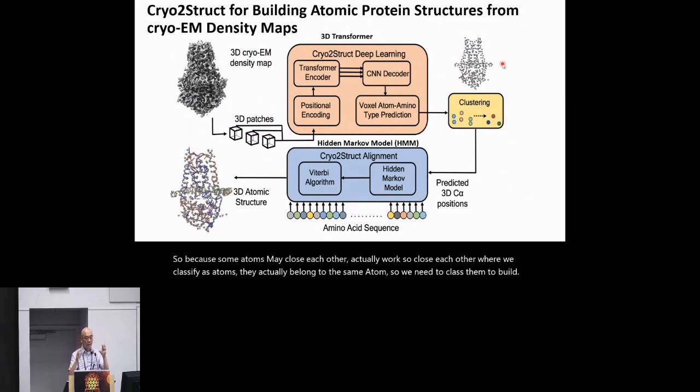identify all the atoms. Now these atoms can be used to build a hidden Markov model, a latent hidden Markov model, because they have the probability, or emission probability, of the amino acid type. Then I can align each chain sequence against this hidden Markov model. So I build the final 3D structure of the protein complex. Now, I would like to describe the details of this approach.